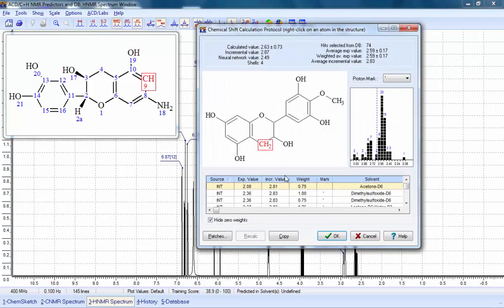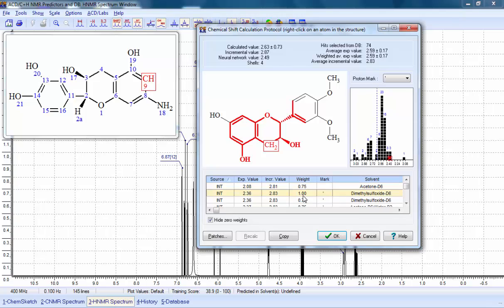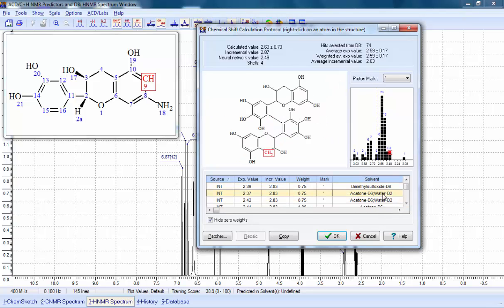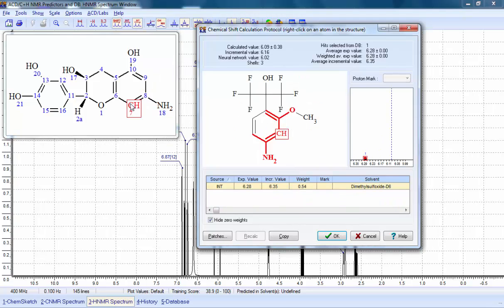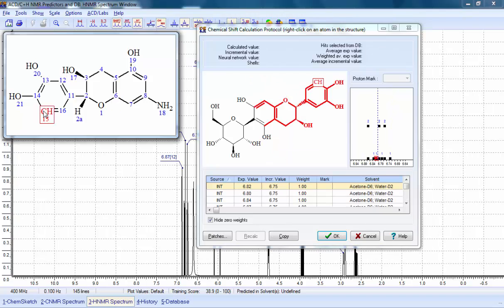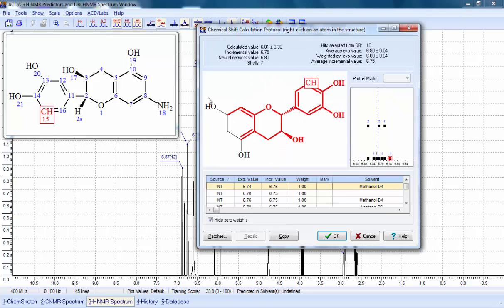We can also investigate the specific calculation protocol for each atom, showing the database records used for the calculation, and the values calculated by both the neural network and incremental approaches. The software highlights the fragments of each structure record which were used in the calculation.